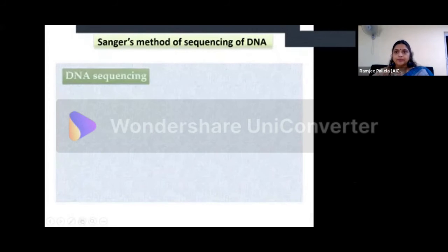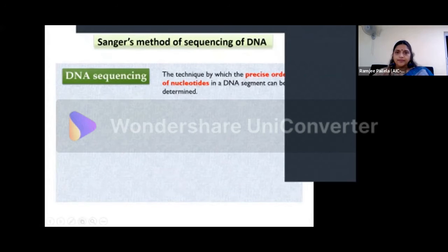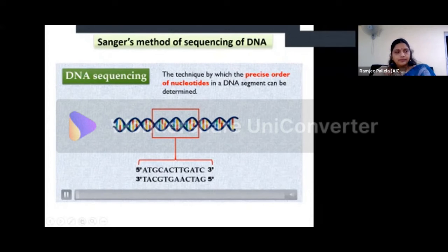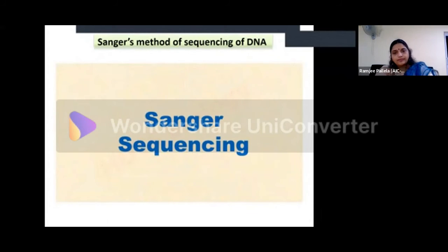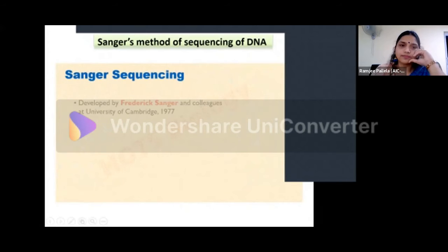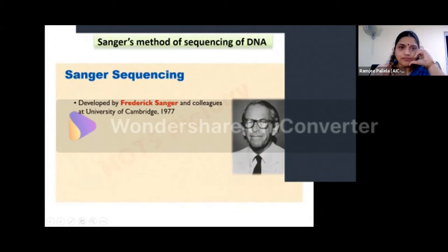What do we mean by DNA sequencing? It is a technique by which the precise order of nucleotides in a DNA segment can be determined. Today we are going to discuss the original Sanger method of DNA sequencing. This method forms the basis of modern computer-automated sequencing techniques. Sanger sequencing was developed by Frederick Sanger and colleagues at the University of Cambridge in 1977.